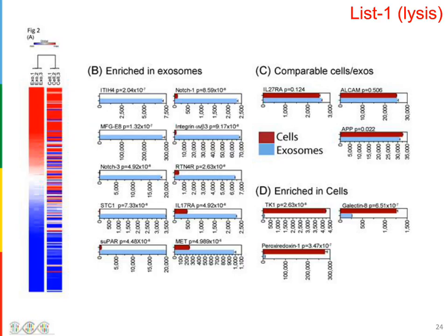This is a classical exosome-associated protein, a very interesting protein, which binds to the exposed phosphatidylserine on the outer leaflet of the vesicle. The other end of that molecule has an integrin binding domain. So this molecule is known to participate in the phagocytic uptake of apoptotic blebs, for example. But we've known for years that MFGE8 is a particular feature of these small exosomal vesicles in addition. So to see it there with striking enrichment was very reassuring that we've got a genuine analysis of vesicles here.